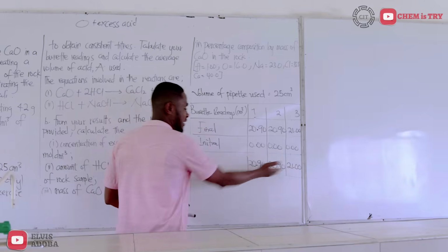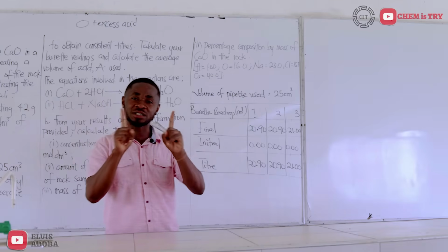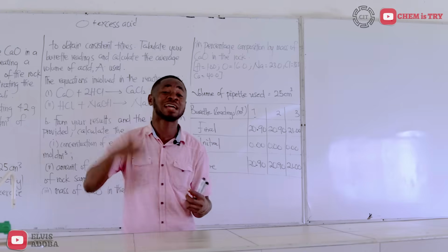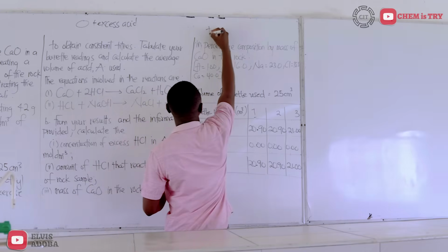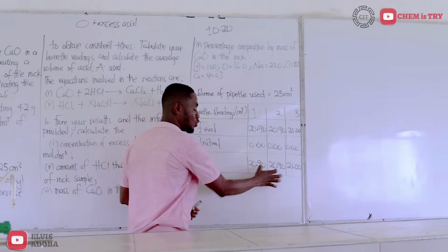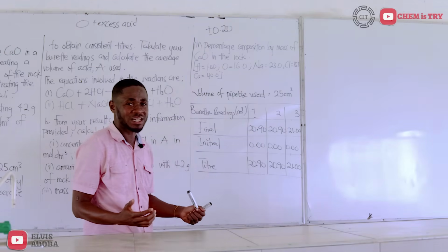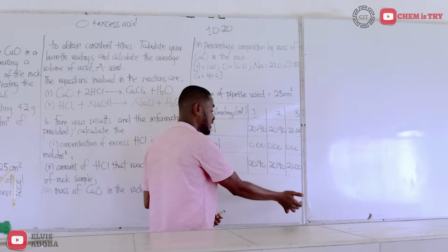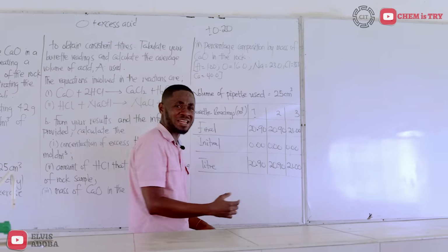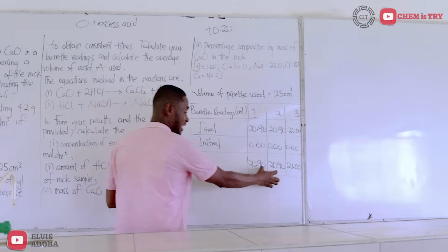So we look at these values, the titers, and we take any two that are consistent, which means their difference should not be more than plus or minus 0.20. Fortunately, these two, the difference is 0.00, so they are consistent. Even these two are still consistent because the difference is 0.10. But 0.00 is more consistent than 0.10. So we are going to pick these two.